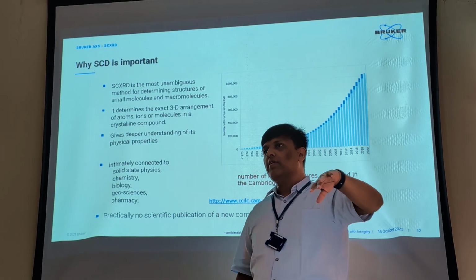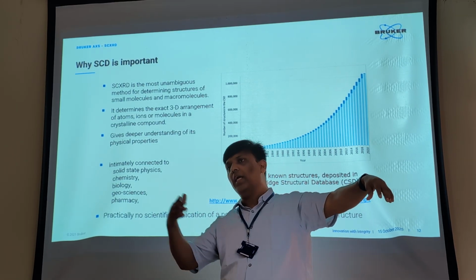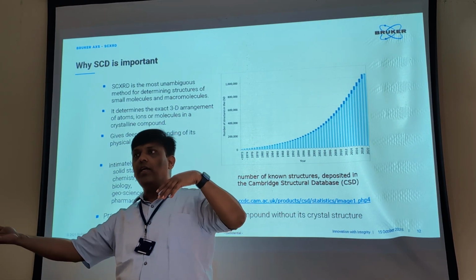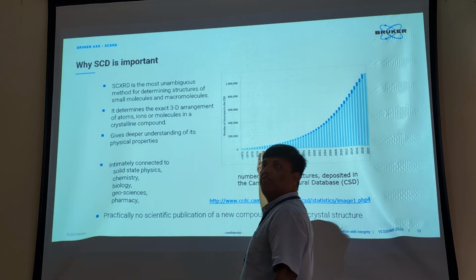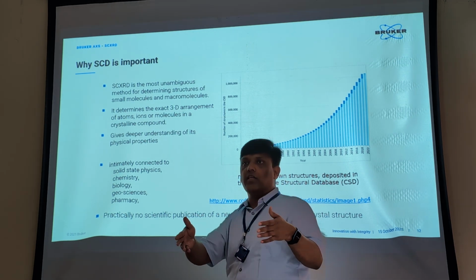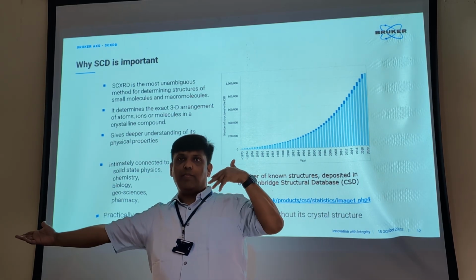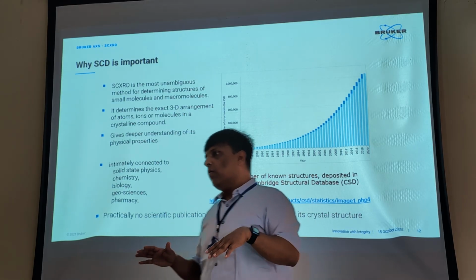Okay, so when you get your structure, you can always report that in the CCDC. You can make the publication later, but you should report your structure, saying that I have found out the structure of this already, and then you can deposit it in the CCDC. That is what I'm taking the information from here. Okay, so then that is your structure. Nobody else can claim it. So once you write a paper, you give a reference that I have already deposited with this CCDC number.